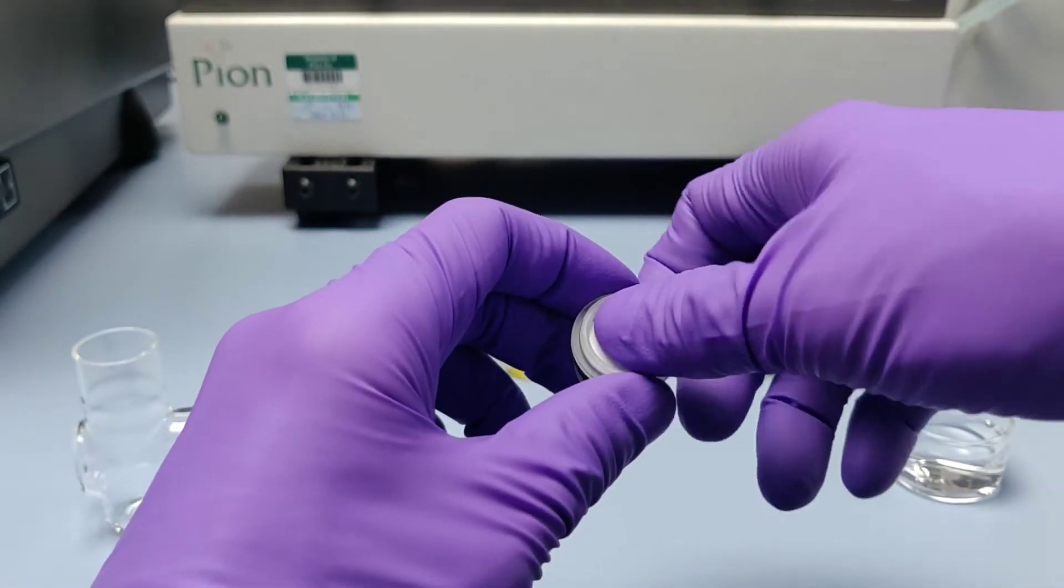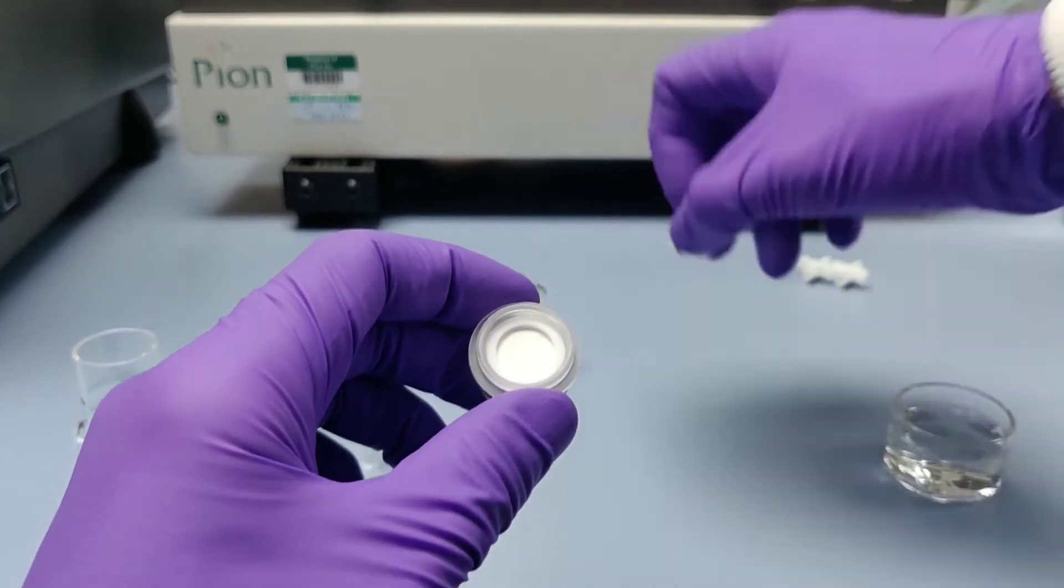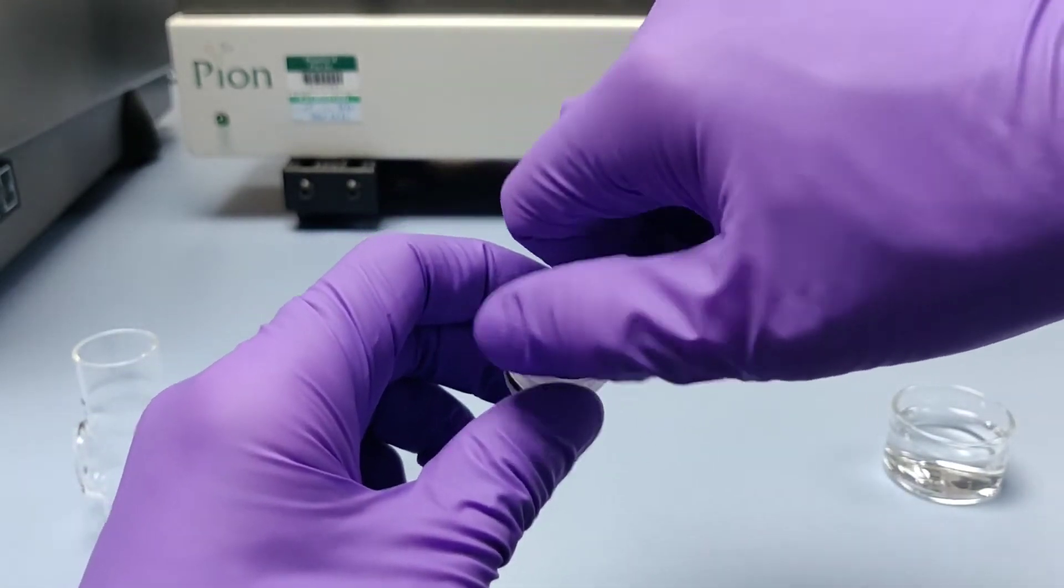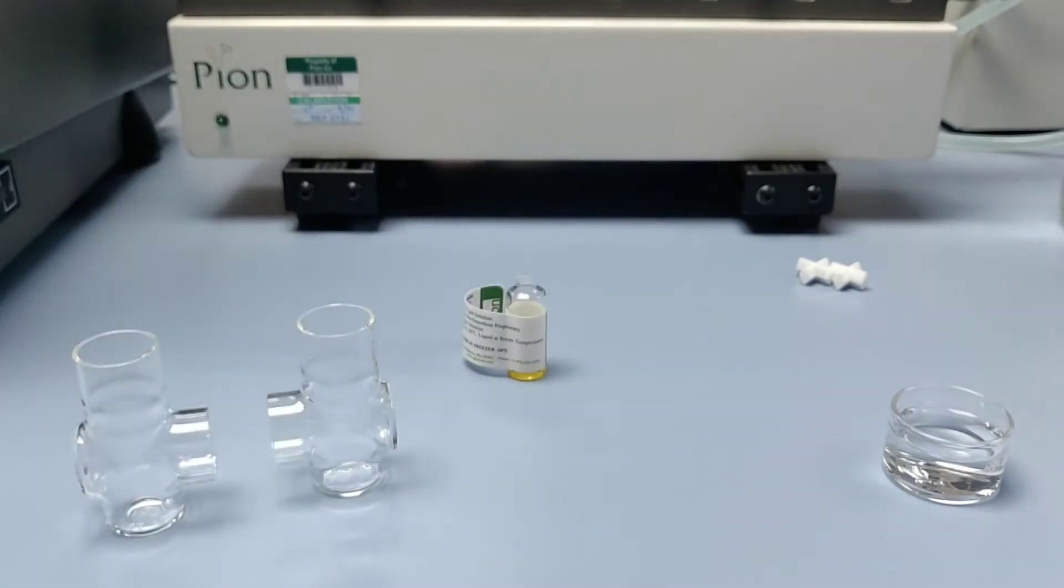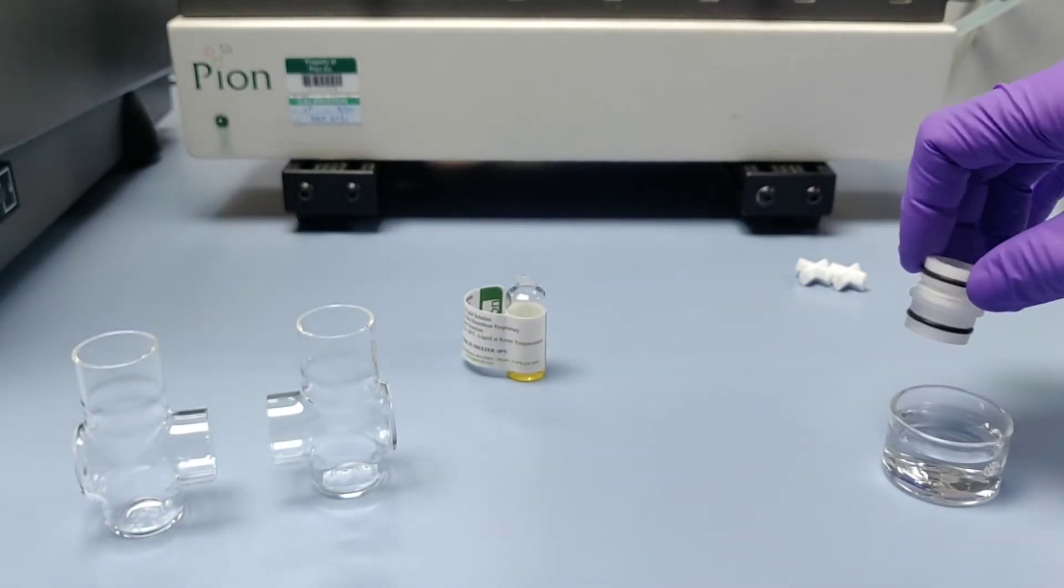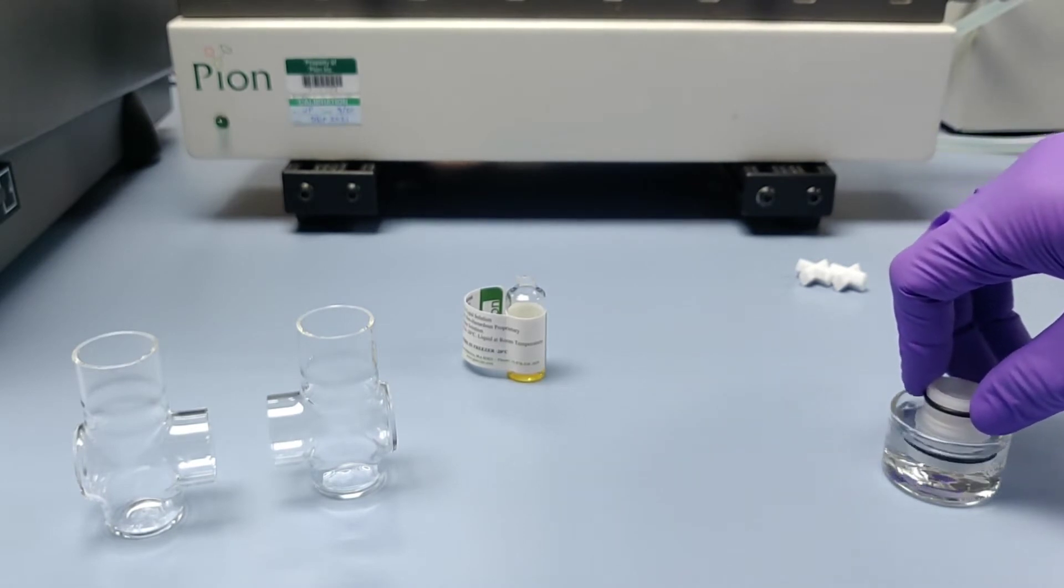On top of the membrane, the Teflon washer is placed, and the male half of the membrane holder is screwed into place. The membrane and holder are bi-directional and can be assembled into the glass pair in either orientation.